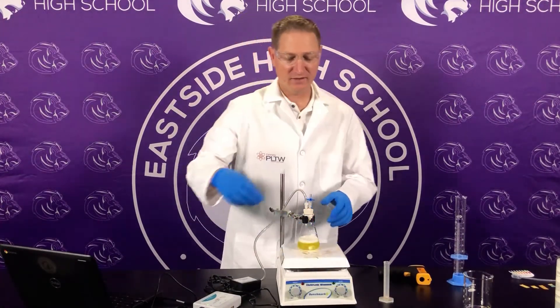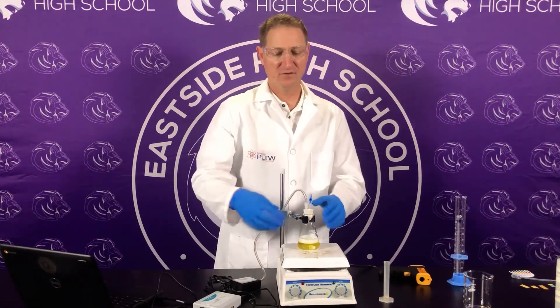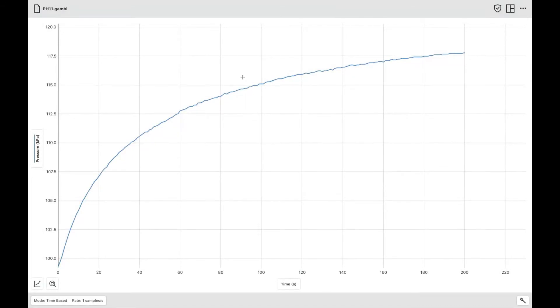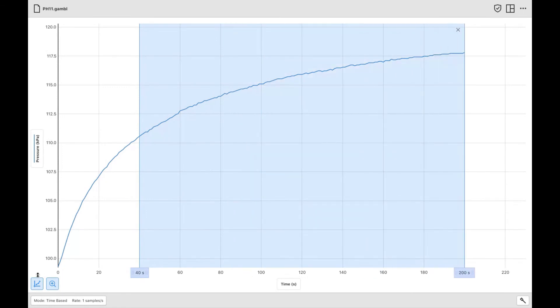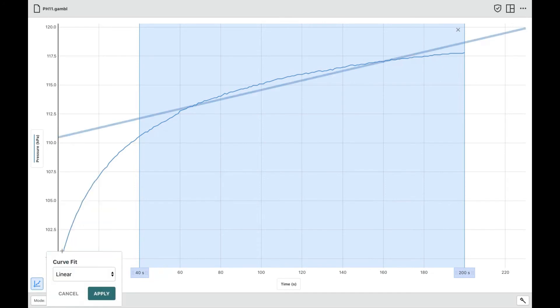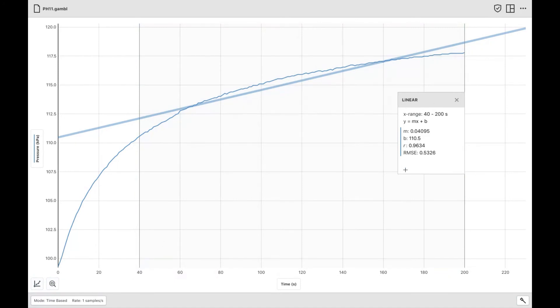Now that we're done with that 200 seconds, I'm going to release the pressure and let it out. We're going to clean up and look at the data. Now that we looked at pH 2 and the baseline pH 4, we're going to look at pH 11 and the rate of reaction. Select from 40 to 200 for our data set, hit graph tools, apply fit curve — it defaults to linear, hit apply. The data we're looking for is M, the slope. We'll take that slope and compare it to pH 2 and the baseline to see which had a faster rate of reaction.